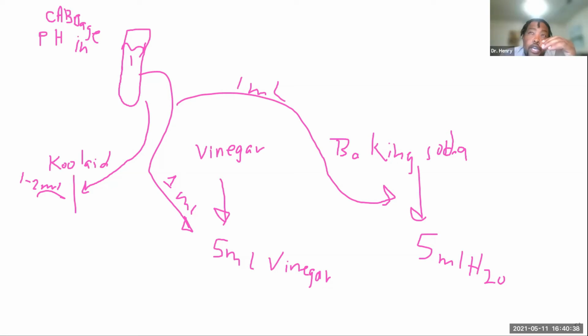I said, if we dilute it by 50 mils, and initially I was going to dilute it by 50 mils, but we know that you're just a little bit over, right? Yeah. Okay, so if we dilute it by 50 mils, it would be too dilute, and then you wouldn't get a really good reading, right? And it'd be inconsistent. So by you cutting it in half, it's a better dilution. So I'm going to adjust that on the lab.